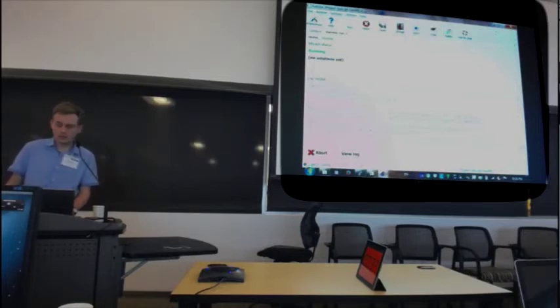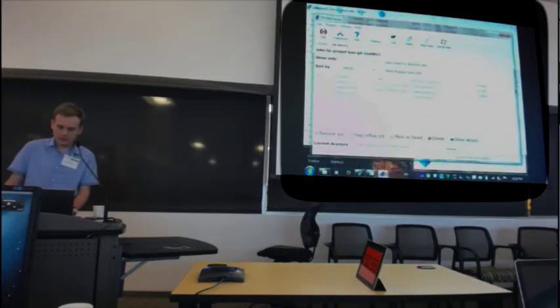So I'm going to show you the results of the finished job that I did on exactly this file, which I finished yesterday.